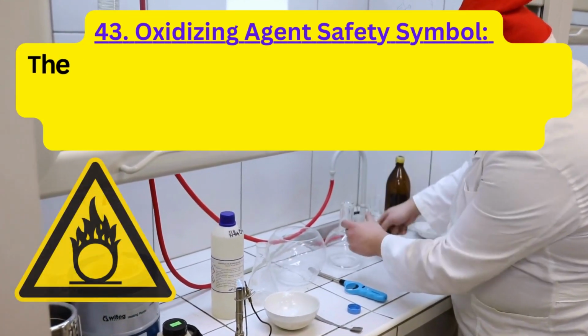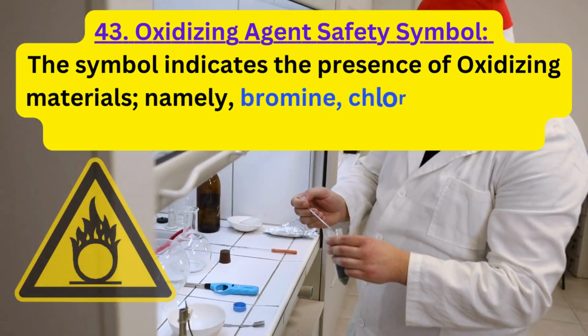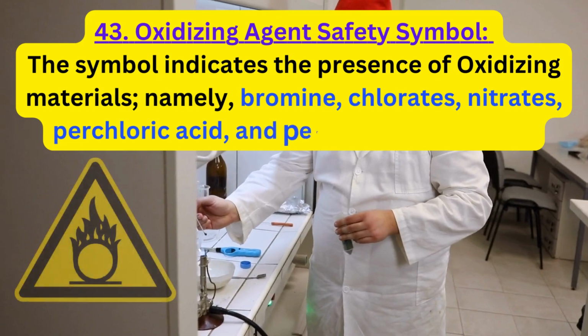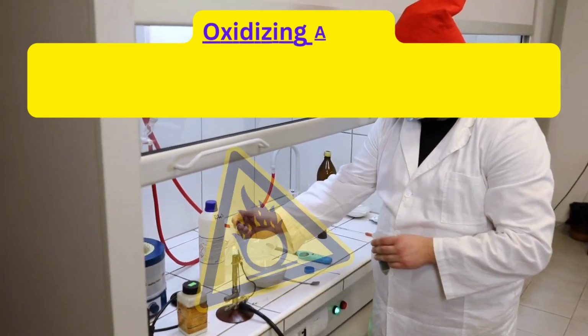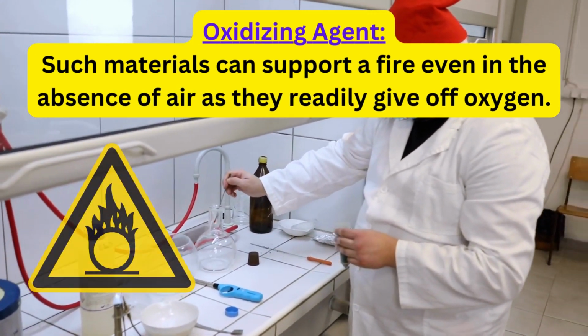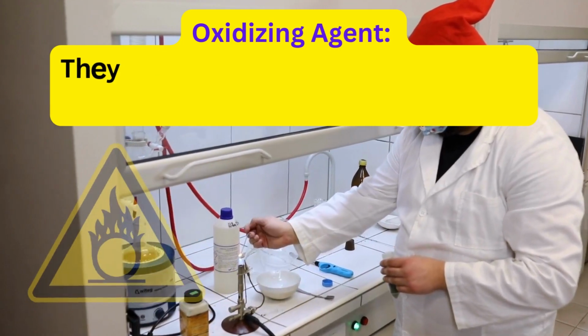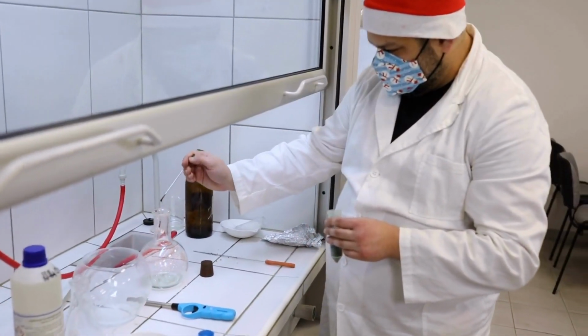43. Oxidizing agent safety symbol. The symbol indicates the presence of oxidizing materials, namely, bromine, chlorates, nitrates, perchloric acid, and peroxides in a lab site. Such materials can support a fire even in the absence of air as they readily give off oxygen. They may also intensify fires to cause explosions and be toxic or corrosive.